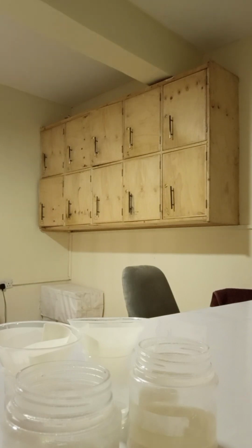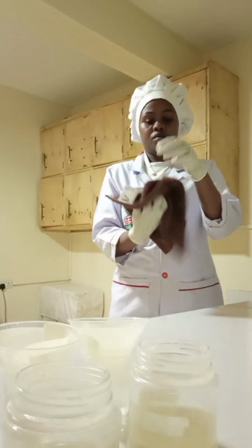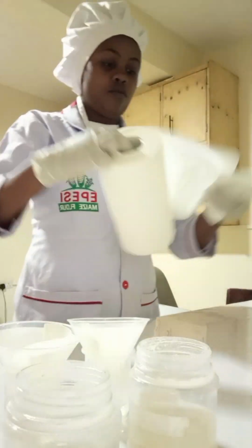This helps us not to contradict or alternate them. You could end up mixing up someone else's sample. That's the reason we label them, so you're 100% sure you haven't interchanged them.